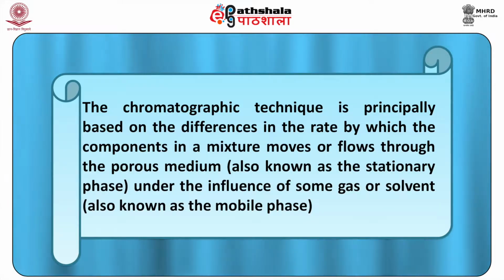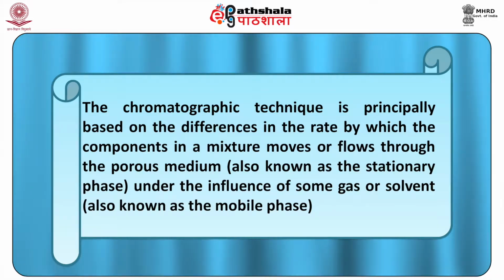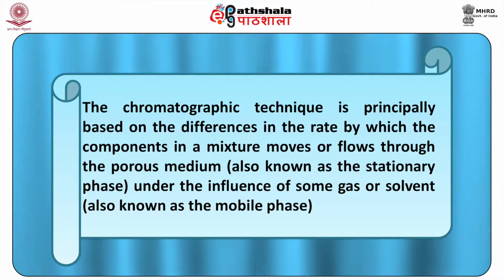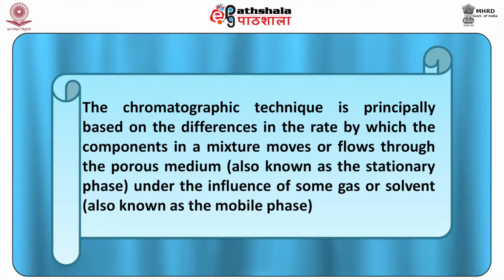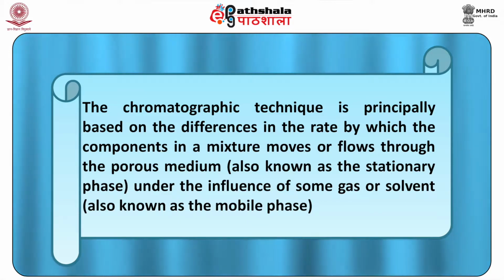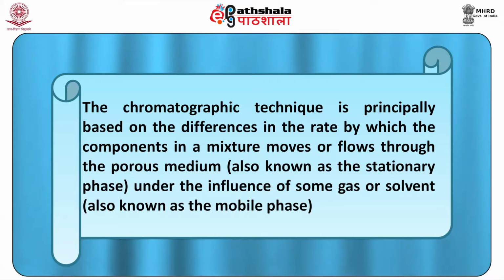The chromatographic technique is principally based on the differences in the rate by which the components in a mixture move or flow through the porous medium, also known as the stationary phase, under the influence of some gas or solvent, also known as the mobile phase.